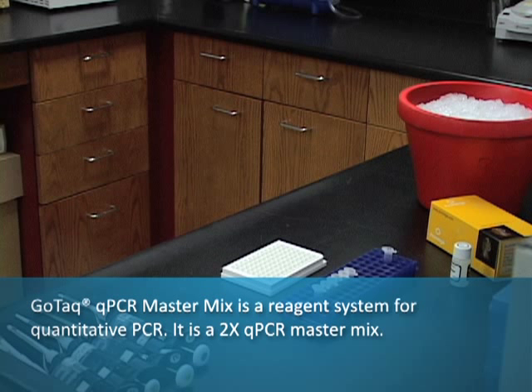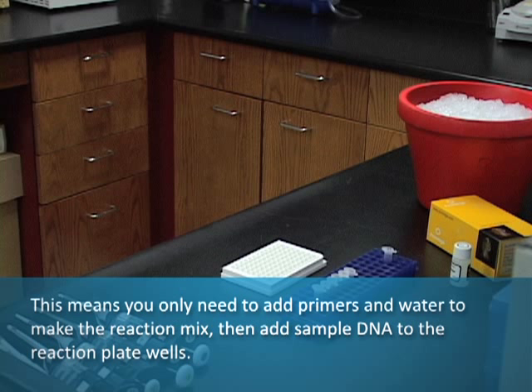GoTAC QPCR MasterMix is a reagent system for quantitative PCR. It is a 2X QPCR MasterMix, which means you only need to add primers and water to make the reaction mix, then add sample DNA to the reaction plate wells.